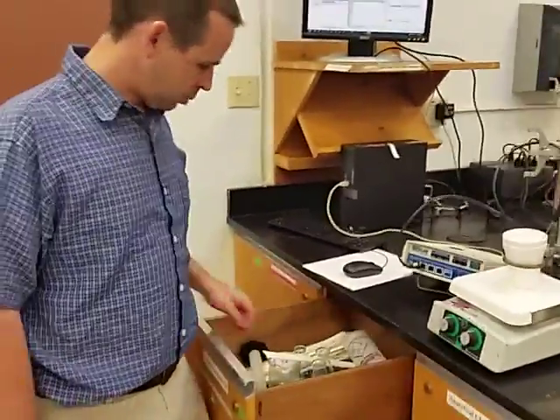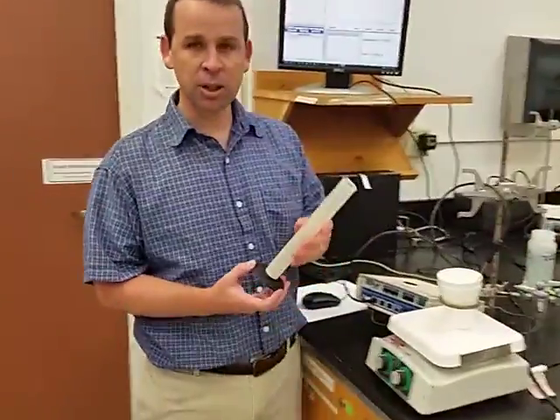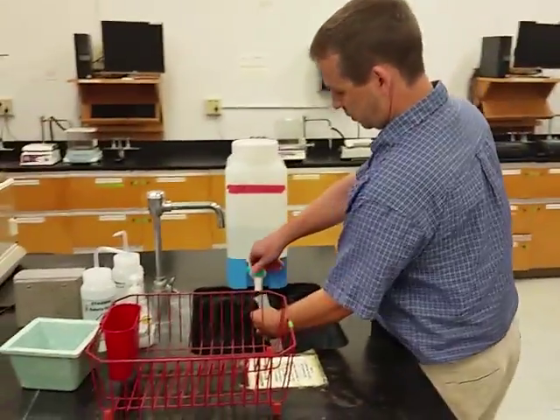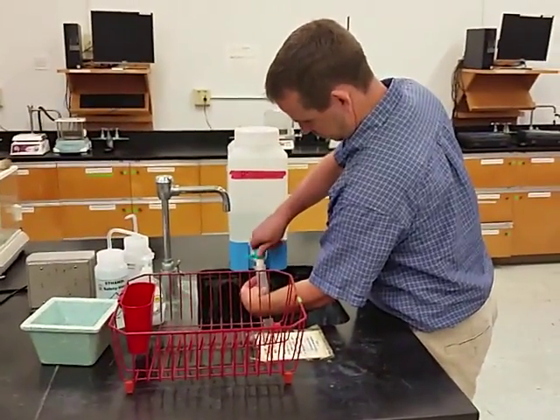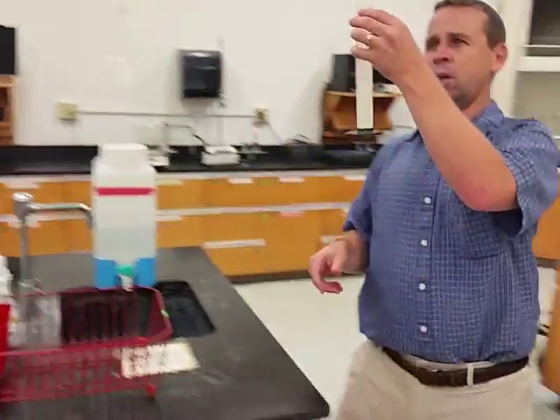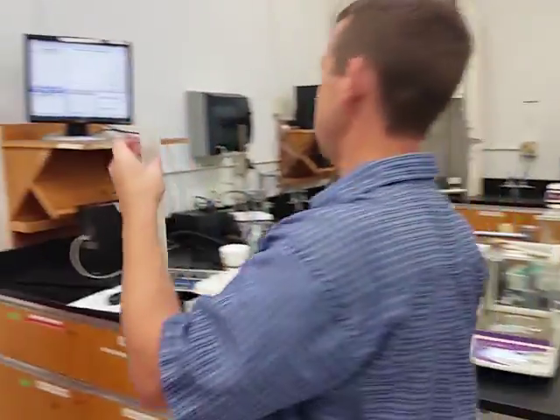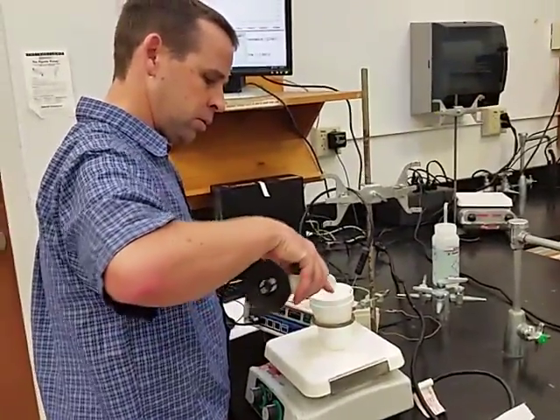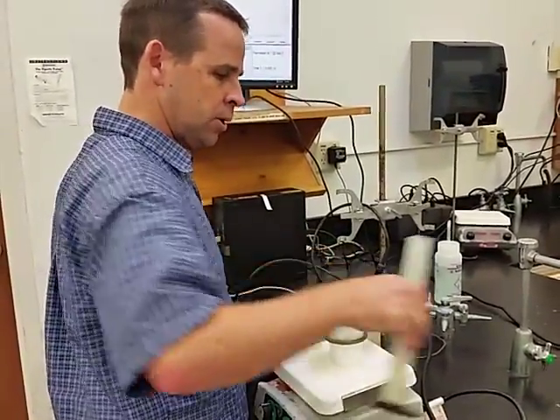So the procedure says to get 100 milliliters of water, 100 grams of water is what it says. So I can use this volume here, 100 milliliters. Okay, make sure it's right on. All right. 100 milliliters of water.